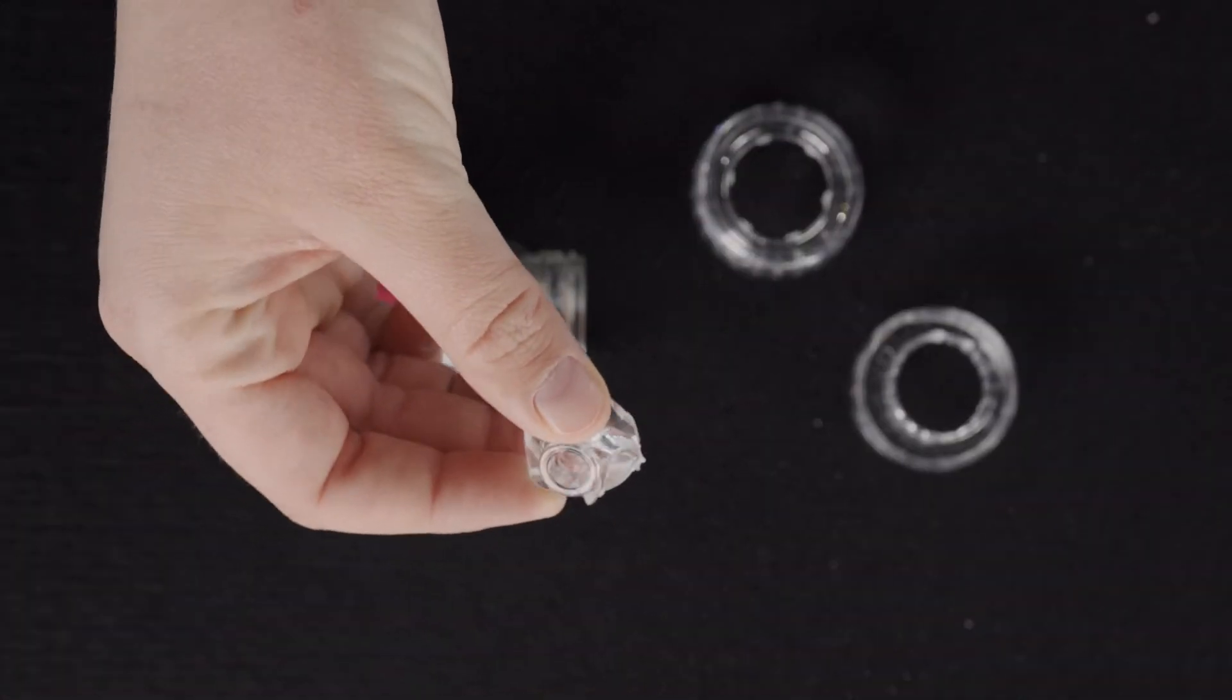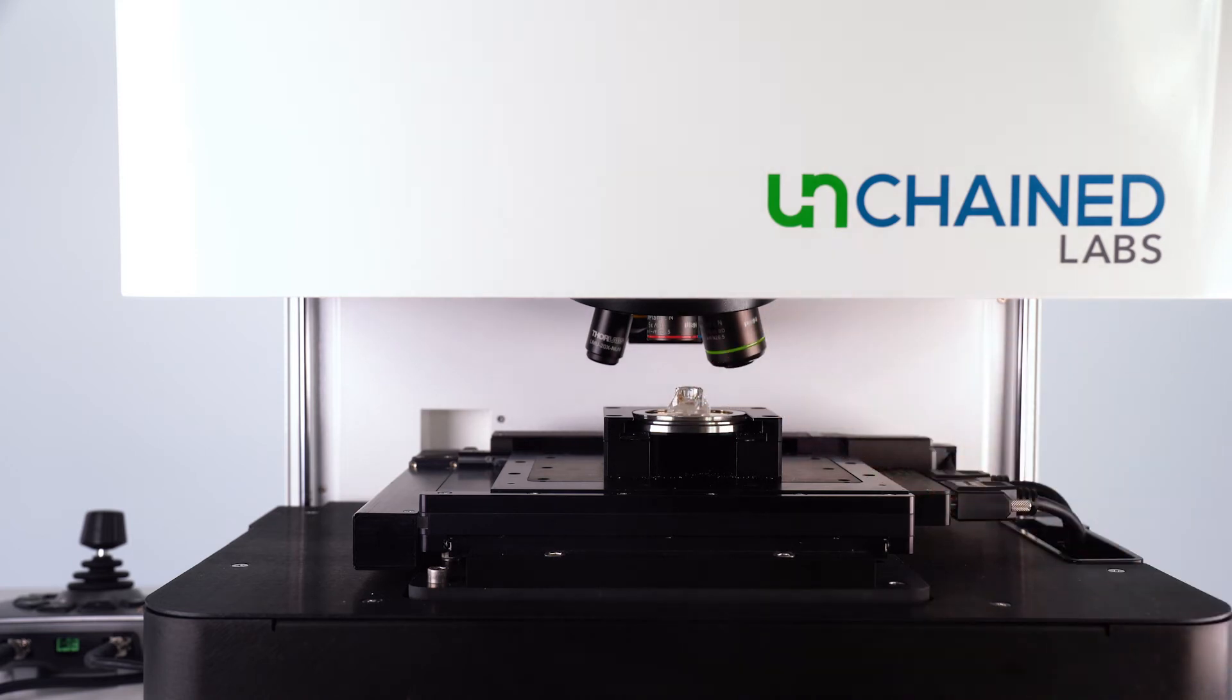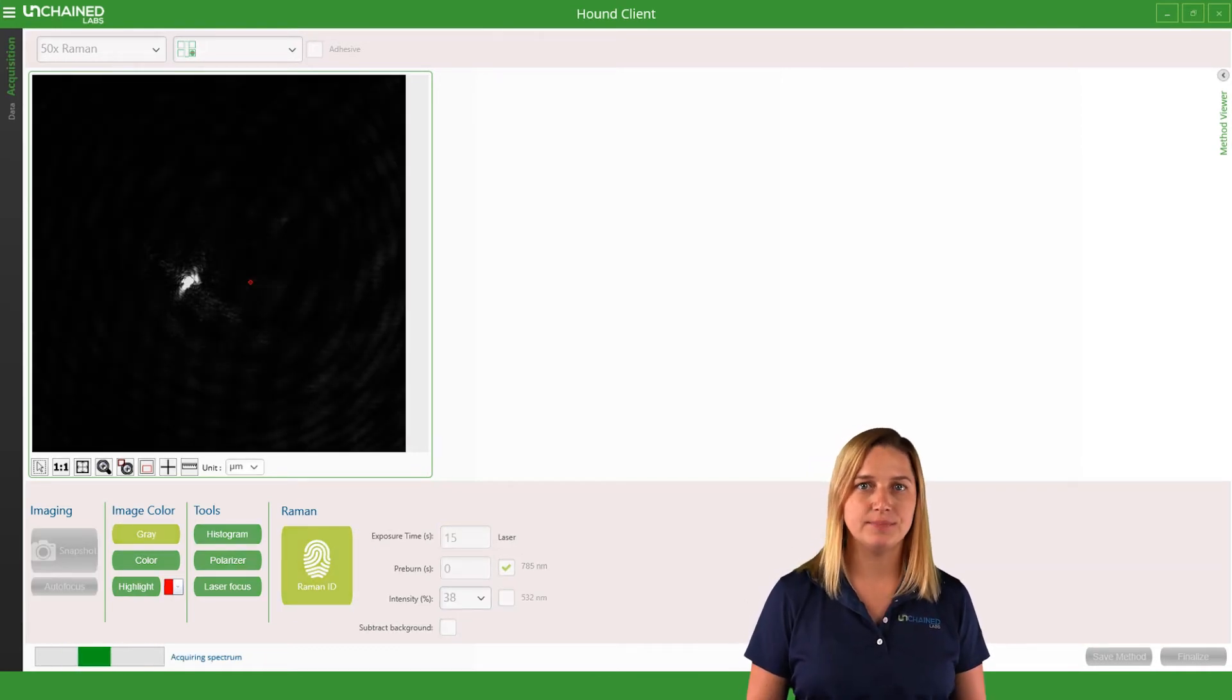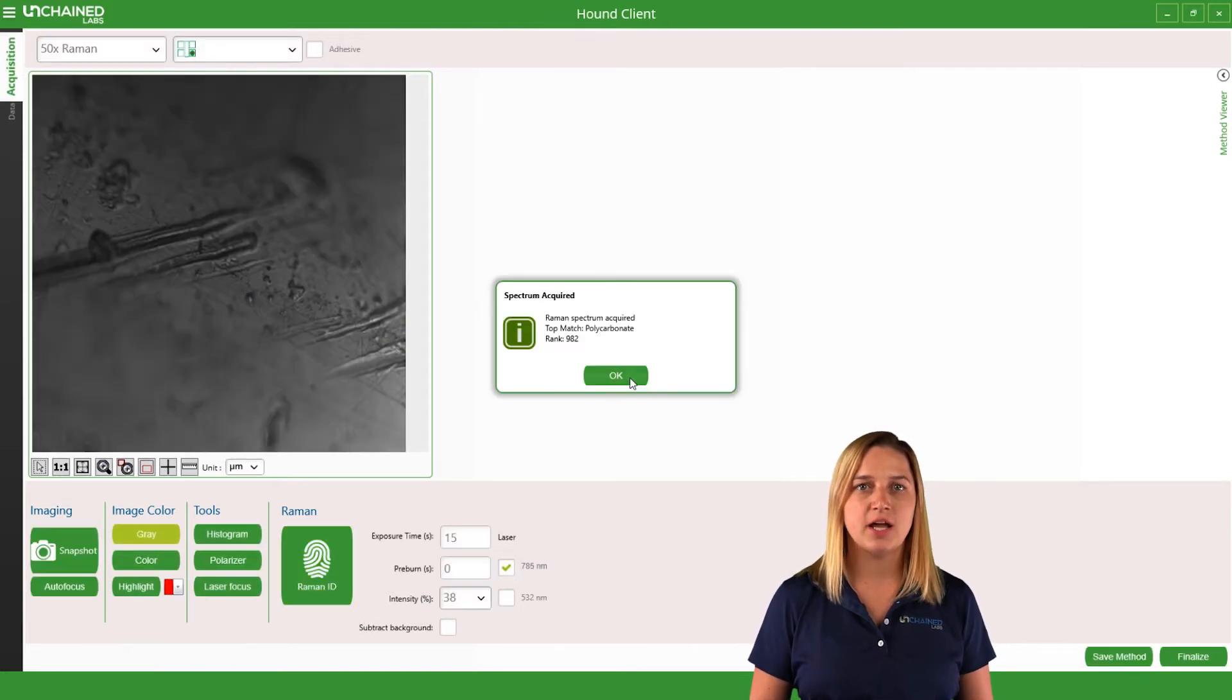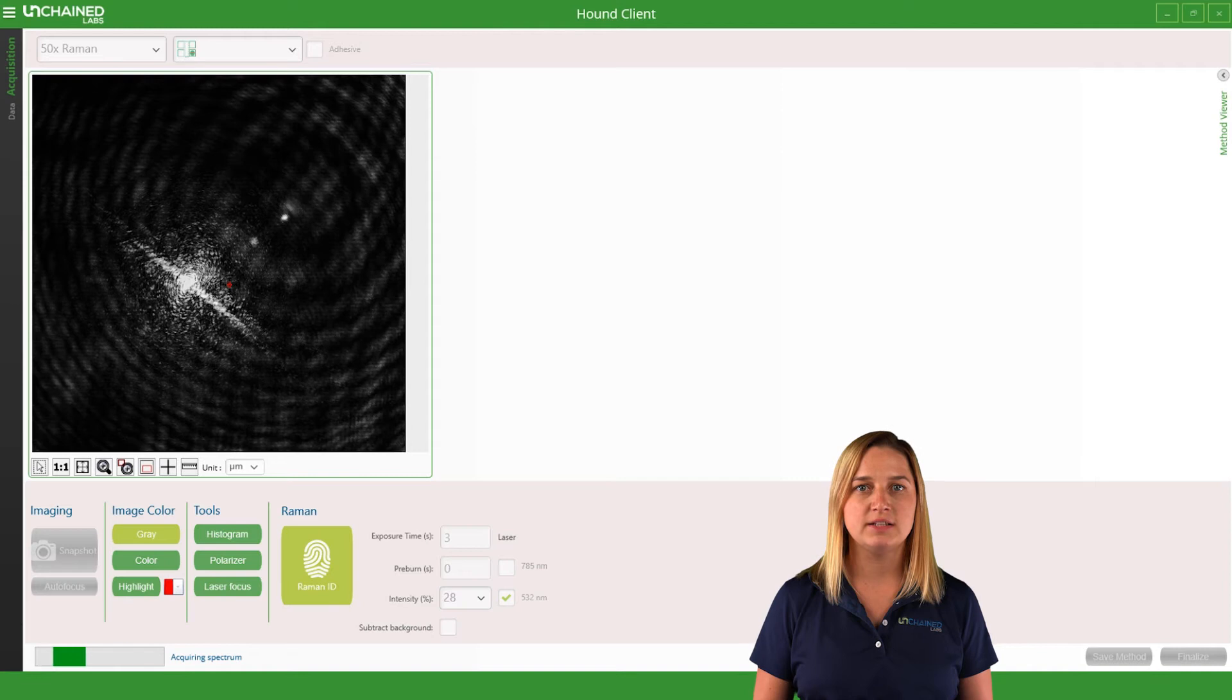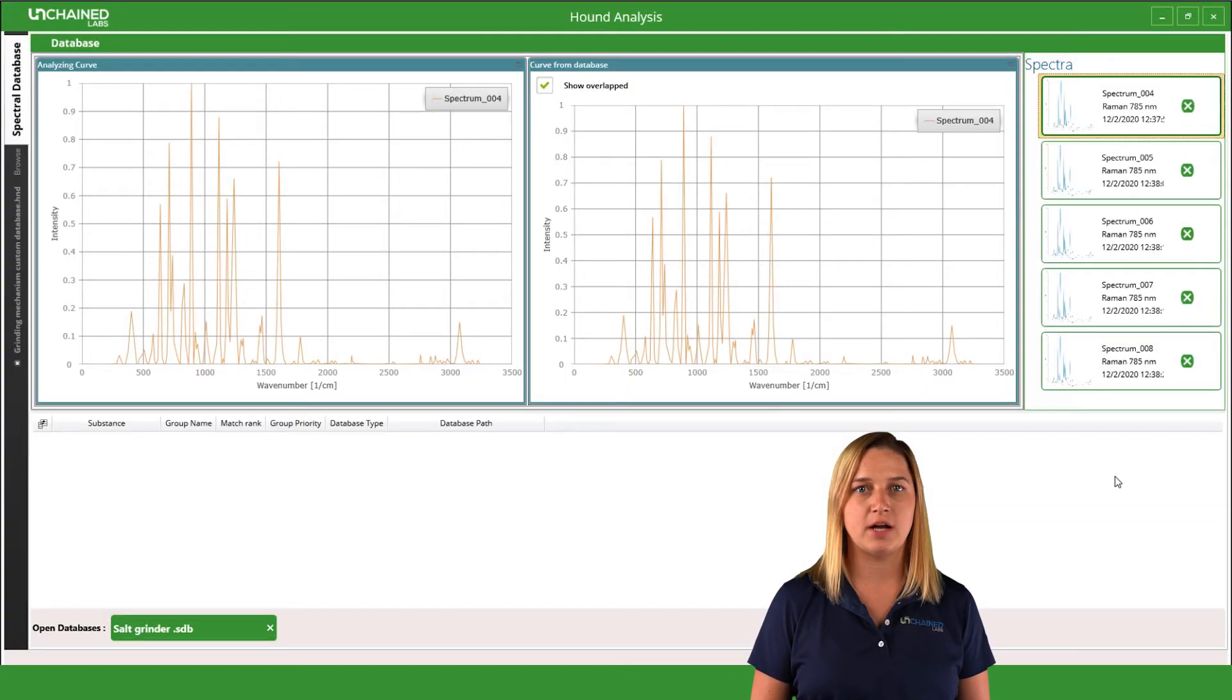I already have a generic reference spectrum for polycarbonate, but I want to find the source of the polycarbonate in the salt. Every material has its own unique chemical signatures, and Raman is sensitive enough to pick up on these differences. I'm collecting spectra from the salt grinder to create a custom reference and determine if the polycarbonate in our salt is identical to the grinder.